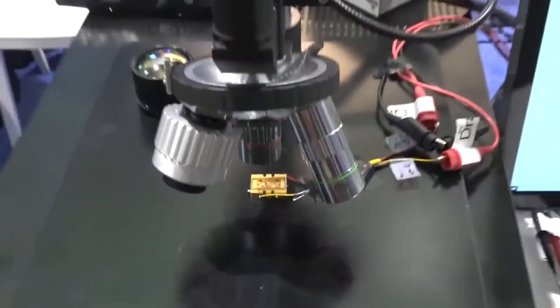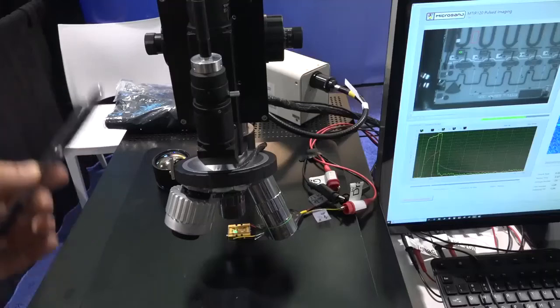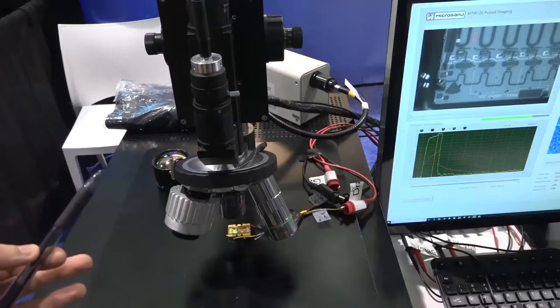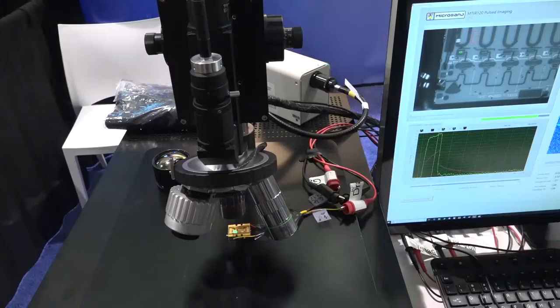Now, why is this such a good idea and such a revolutionary idea? Because it allows you several things. You don't need a thermal imaging system that is designed to operate at several micrometers. You are operating in visible light, which means all of your microscope devices and components are operating in visible light. You can see right through them as you would normally do with any microscope.